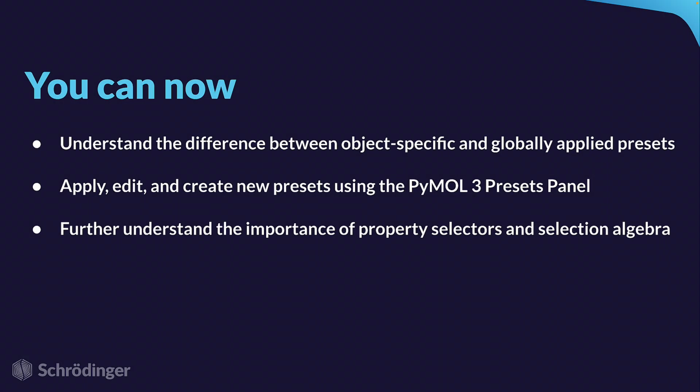That brings us to the end of this tutorial. You can now understand the difference between object-specific and globally applied presets, apply, edit and create new global presets using the PyMOL 3 presets panel, and further understand the importance of property selectors and selection algebra.